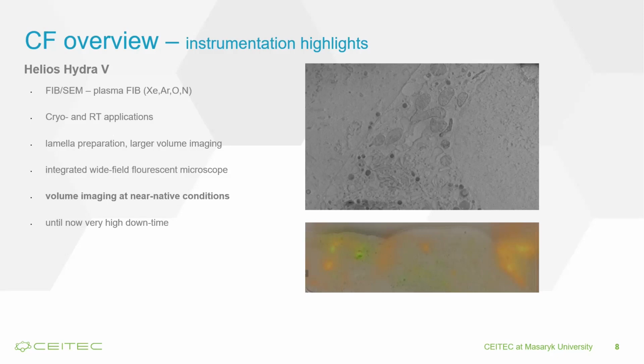That is the case with this half developmental tools, unfortunately. We believe we are getting close to the resolution of most of the issues with this instrument, and hopefully to get more into the higher throughput service mode. So if you're maybe interested in the volumetric analysis of the cellular samples at the ultrastructural level, I repeat, then this technology can actually save a bit of a sample prep and image your specimens at more near native conditions.